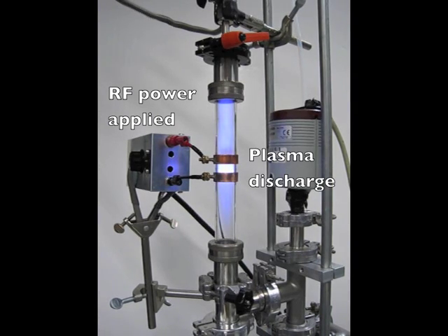When radio frequency power is applied to the copper ring electrodes, the argon gas is excited and partially ionized. This is a plasma.